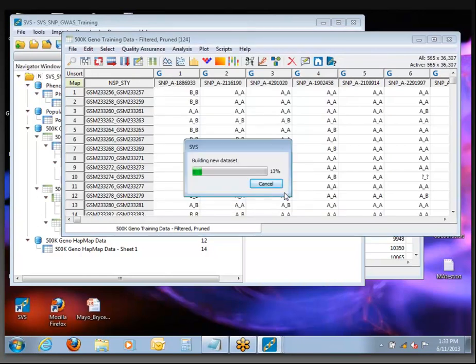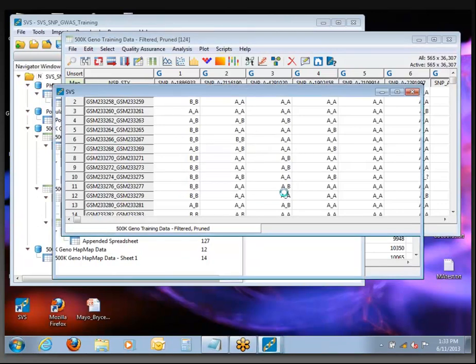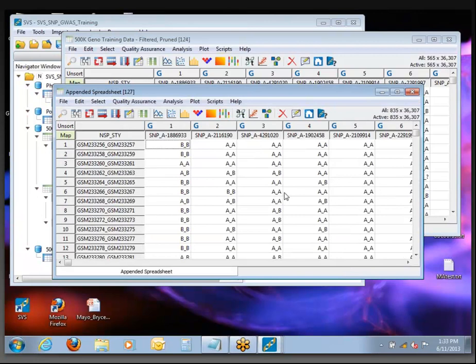This one takes a bit longer than the Join or Merge because it actually is going to rewrite the data set on disk, whereas the others are just creating a new view in a relational sense.